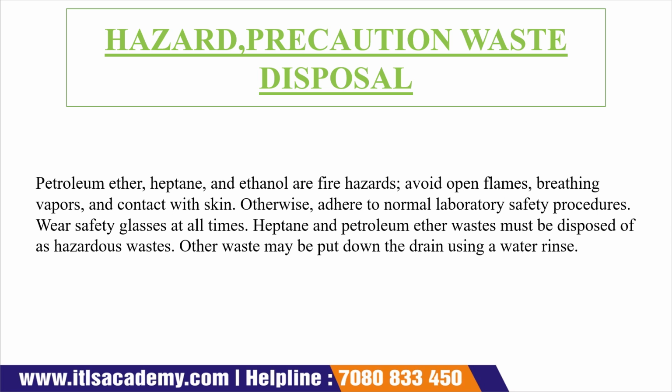The heptane and petroleum ether waste can be disposed of as hazardous waste, and the other waste should be drained out using a water rinse, and we have also followed the protocol given by our institution.